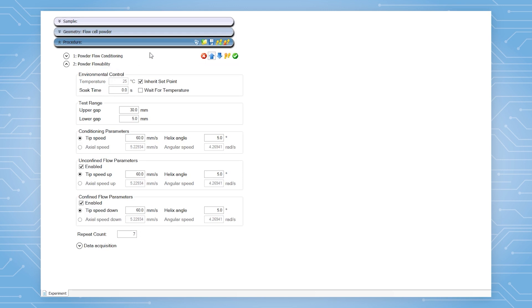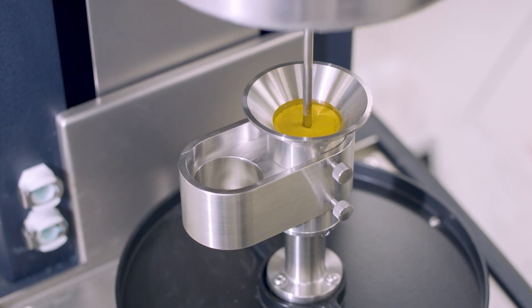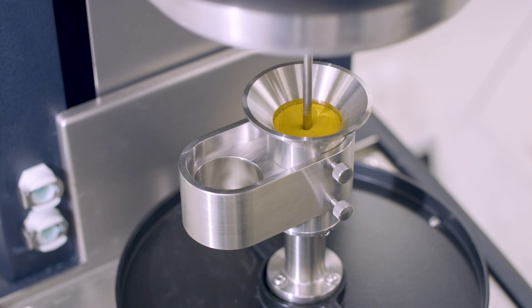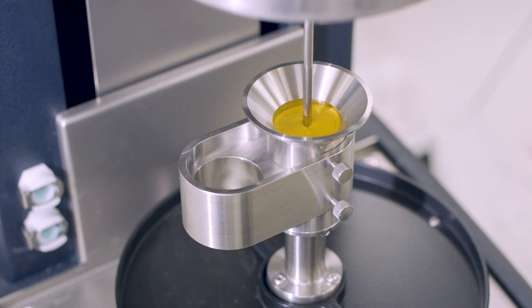The conditioning step is used to provide a well-defined loosely packed initial condition. Conditioning is achieved by stirring the powder downwards and then upwards at a set tip speed.